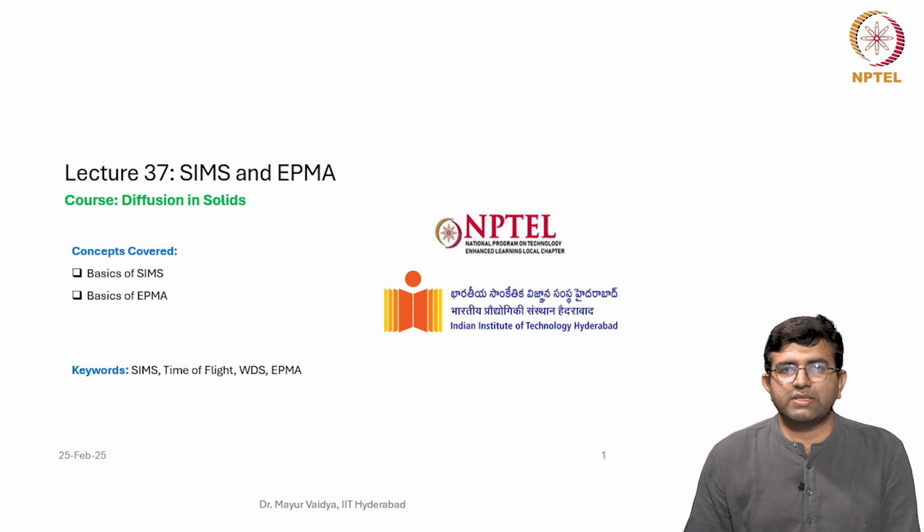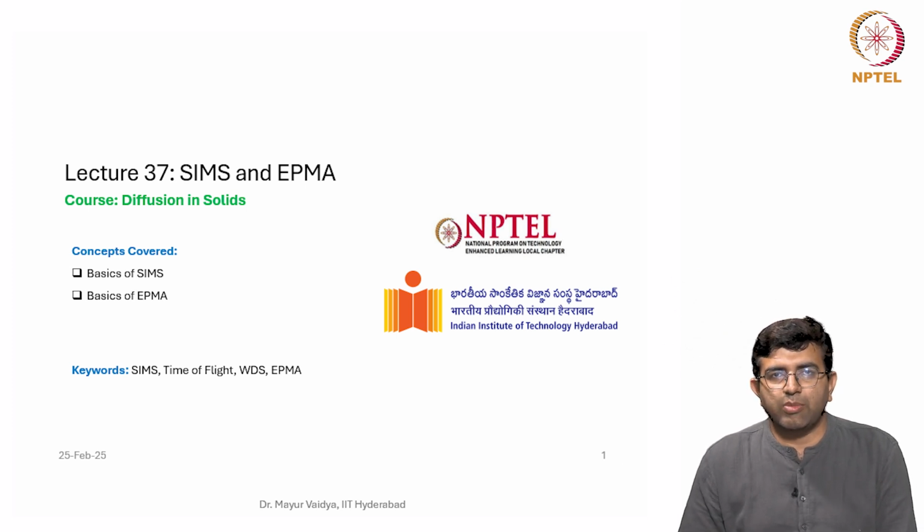One is known as SIMS, which stands for secondary ion mass spectrometry, and the other is EPMA, which is electron probe microanalysis. In some references, you will also see it written as EMPA, that is electron microprobe analysis. So these are the keywords, and we will be covering the basics of SIMS and EPMA in this lecture.